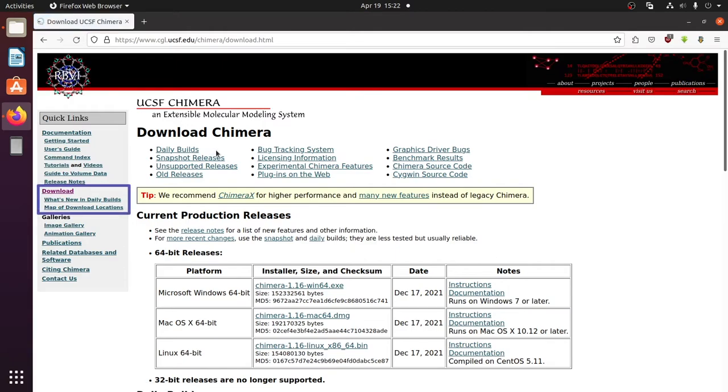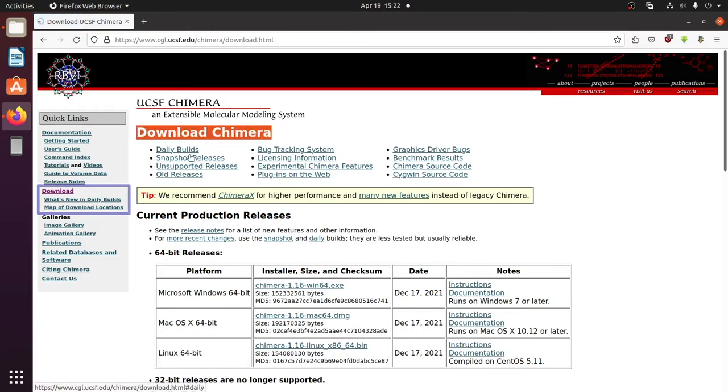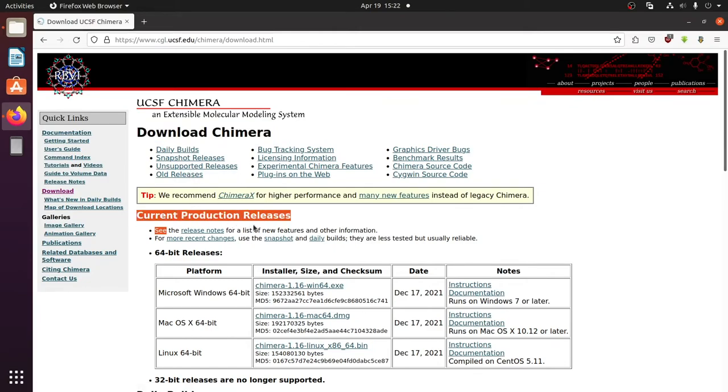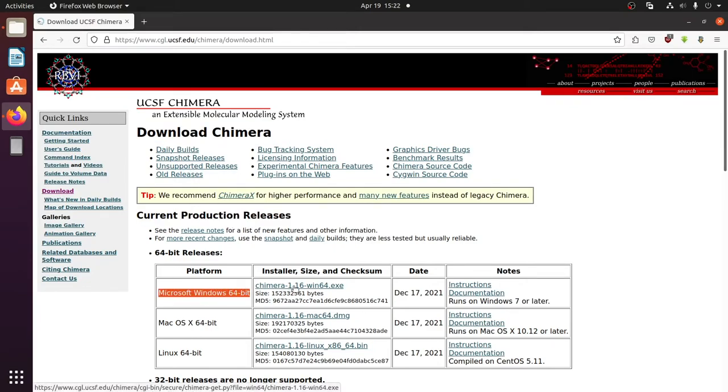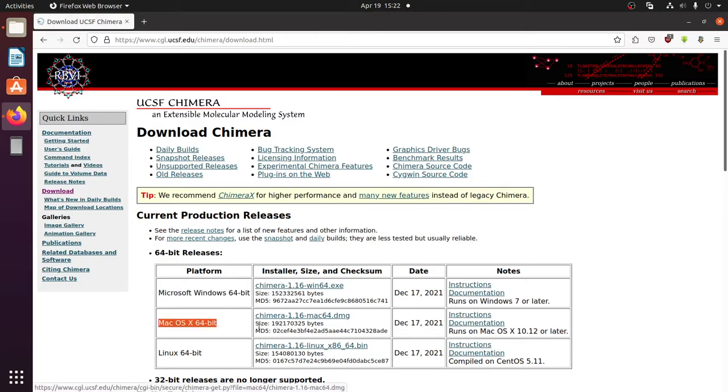Make sure you are in the download section on the left side. This is the current production release. Click the Linux 64-bit version.